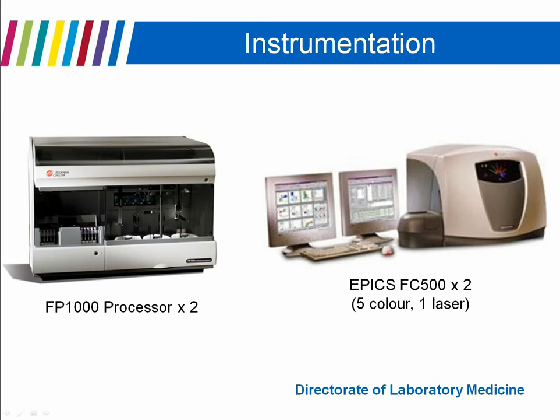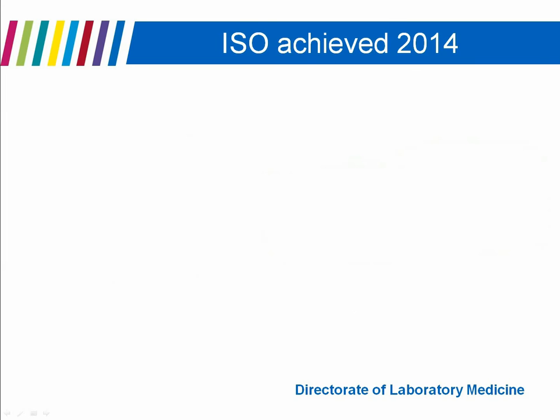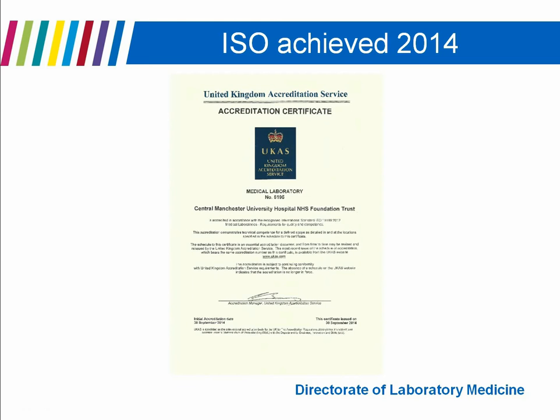The lab had our first ISO visit back in November 2013, and we achieved ISO in September 2014, and we've just recently undergone our first surveillance visit, and our acute leukemia panel was one of the tests that was focused upon.